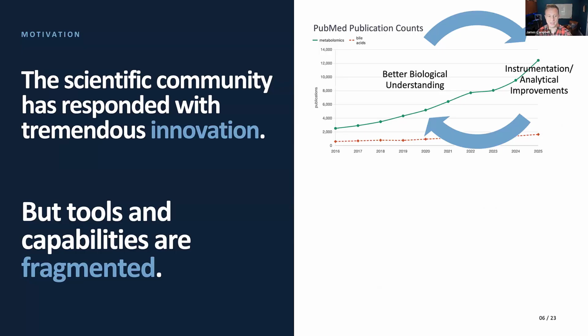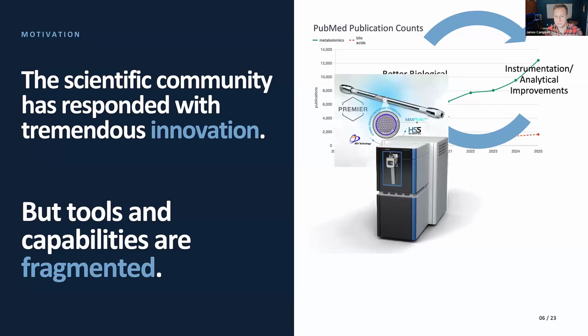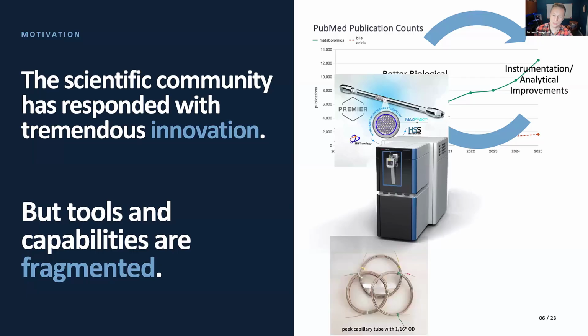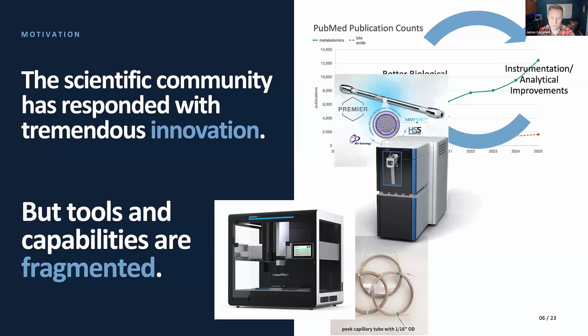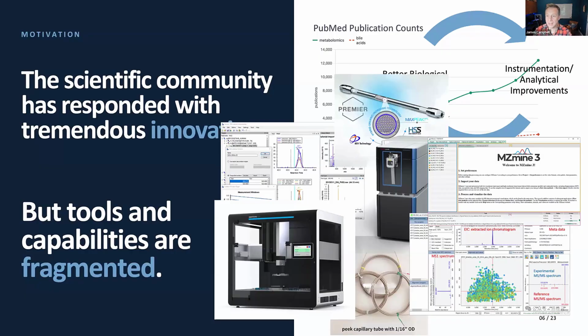But one of the downsides of that is that the tools are really fragmented. Mike mentioned a little bit ago that we're kicking off ASMS right now, and I'm sure that when we go to ASMS, we're going to learn about the newest, latest, greatest instrument that's come out, and then we're going to remember that we have to pick up the best column that we ever could hear about, and make sure we're using the right new tubing and the right sample prep automation, and the software and the software and the software, right? There's a lot going on that can be very difficult to stitch together.